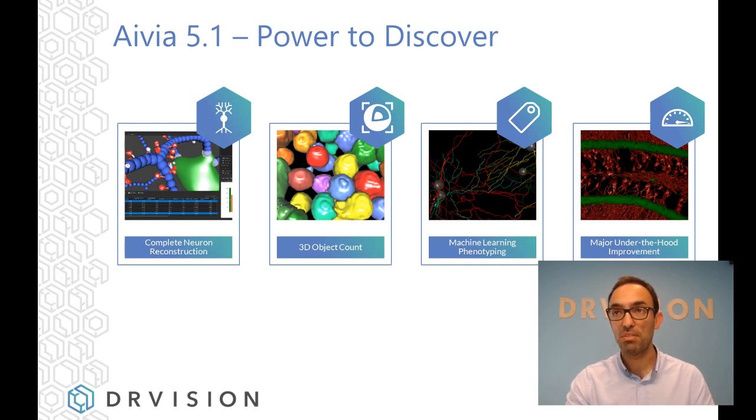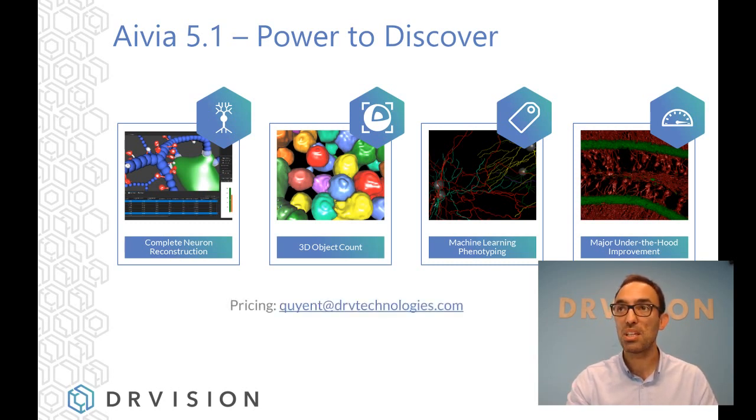And we've made some significant improvements in the speed as well, in general, in the speed of rendering objects. That's what I've just covered.